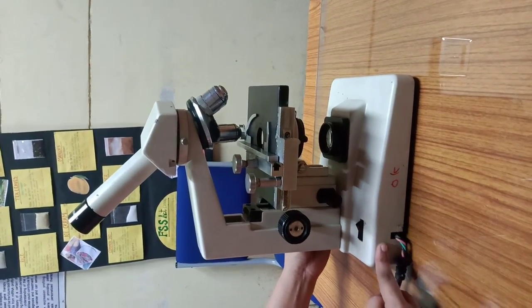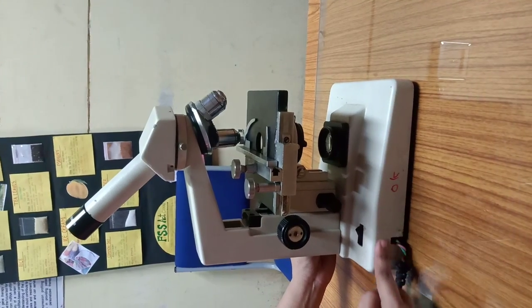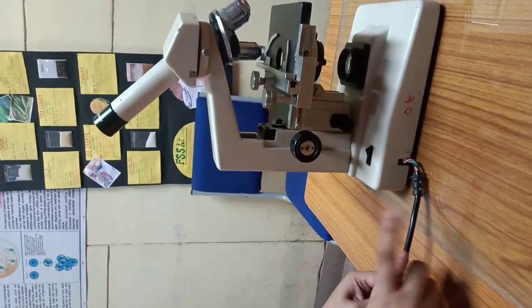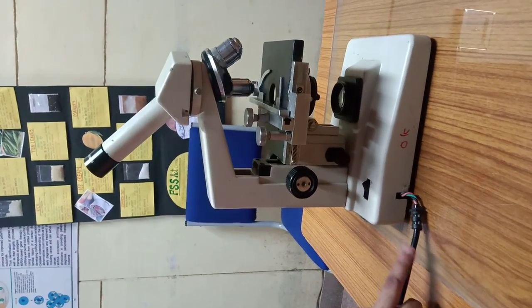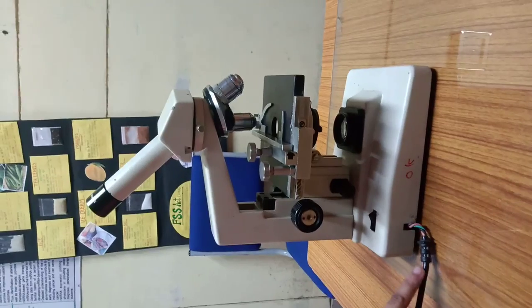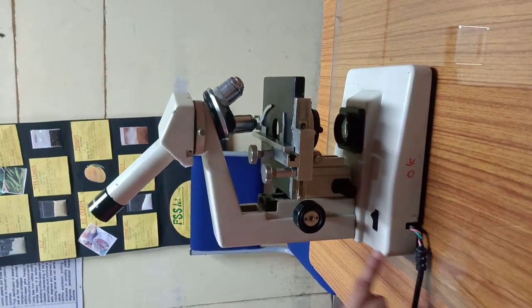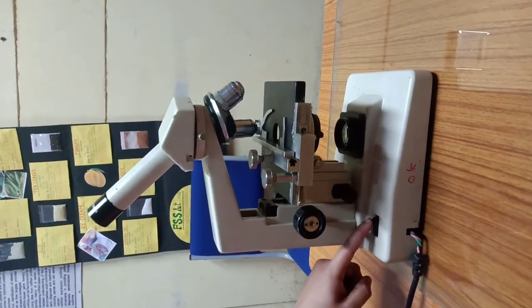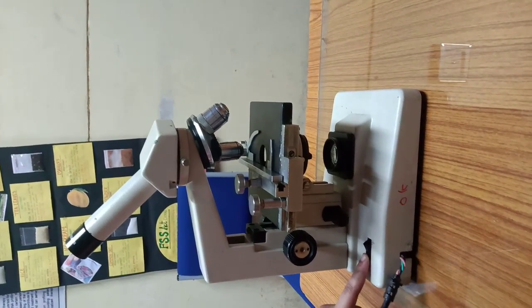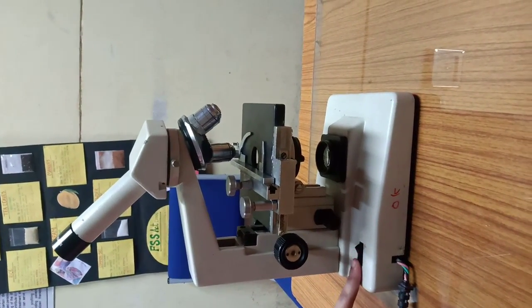This is the base or the resting platform of the microscope. This is the wire that supplies the electric current. You need to switch on and off the electric supply to function the microscope. Then there is a switch right here. You can switch the electric supply off and on.